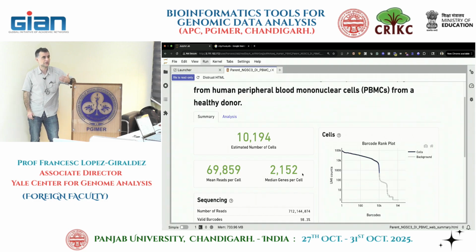So you need to evaluate why this is happening too, why you didn't get the expected one. The problem is with this, because it's expensive, we tend to be too tight to 20,000, and that's annoying. Because then if one sample doesn't work, all of a sudden you need to repeat it or add more sequencing. And that's always a problem for us too.